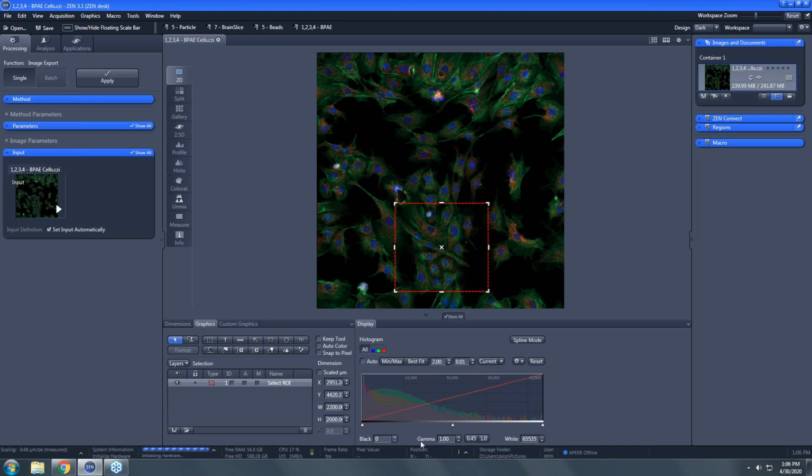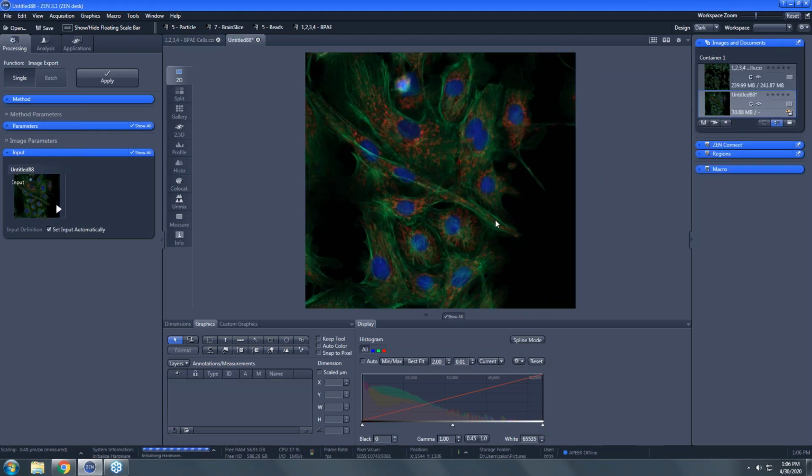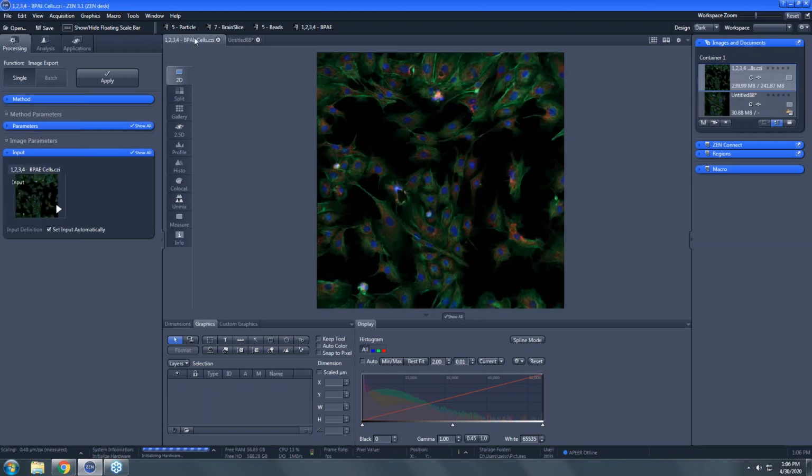Now that we've got that squared away, then we can right click on the ROI tool and say create subset 2/3 of the way down the window, and we will get a subset from this. And that will pop out a new portion of the image. Let's do that 2 more times, if you would, Nicole, in different areas, and then we can use those images that we do as subsets as the basis for creating a figure.